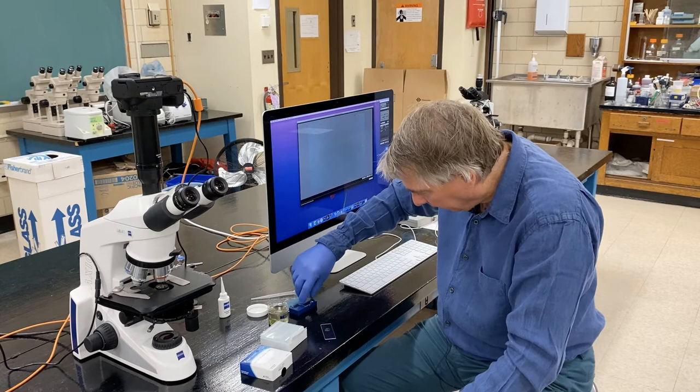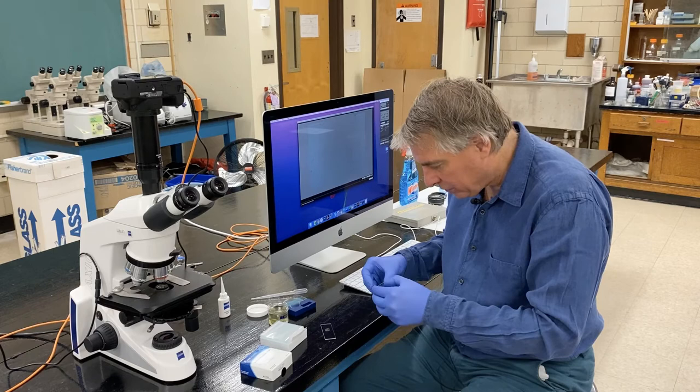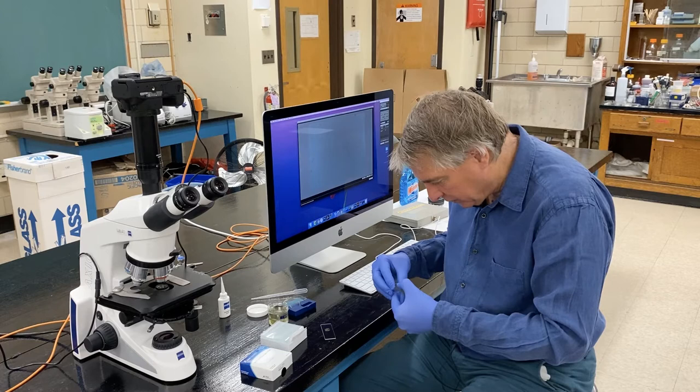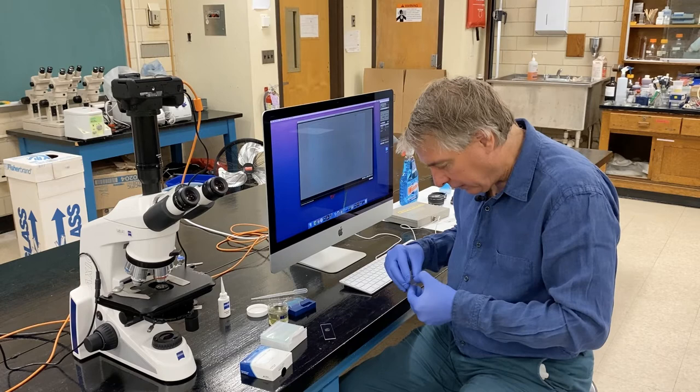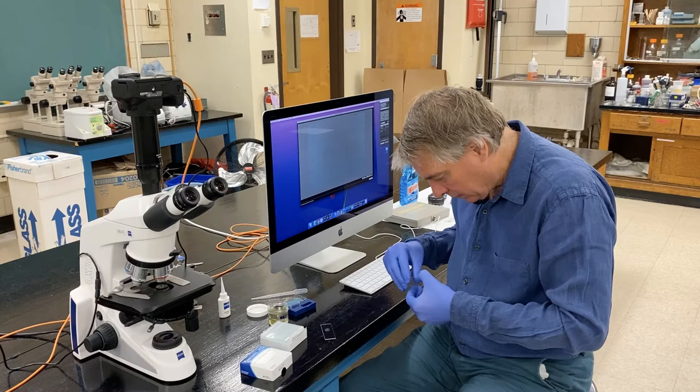And then I'm going to put a microscope cover slip, a glass cover slip, which are very thin, so you have to be careful. And sometimes you end up with two that are stuck together, so you want to try to avoid that. The microscopes are designed to work with a specific thickness of glass. Well, I can tell that there's two here. Oh, there it goes. Okay, so I got it apart.